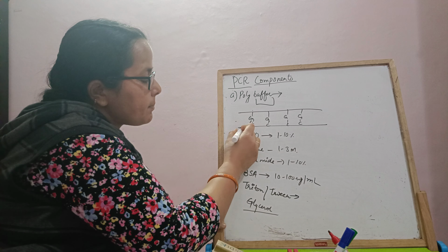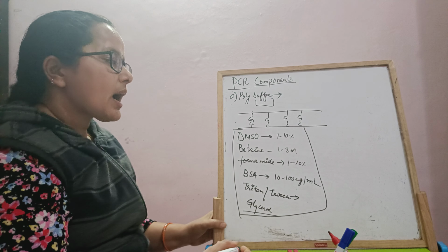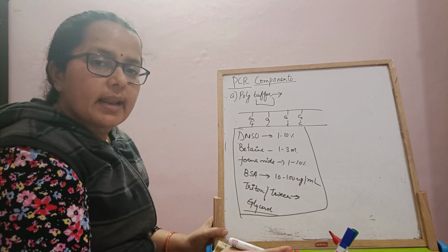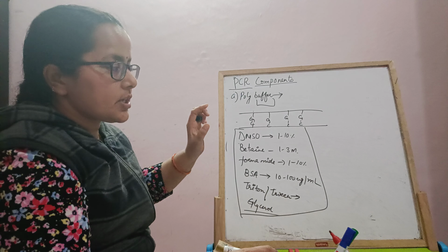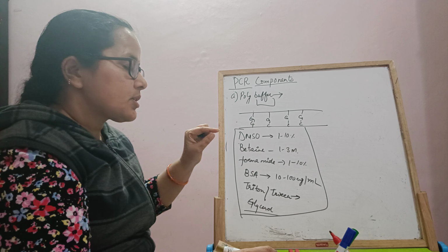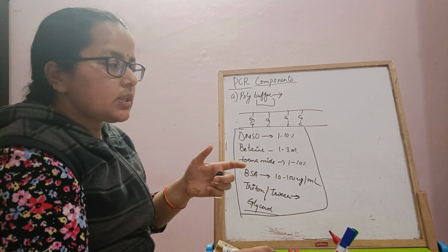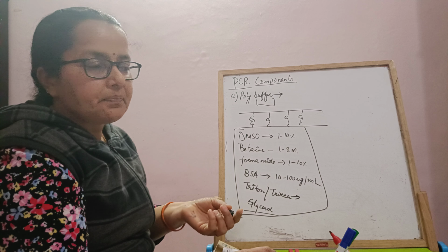Whenever we want to use these components, we have to standardize them according to the PCR we want to amplify in our lab. So all these components we can add to GC-rich templates. Wherever we are working with GC-rich templates, we have to select one of them to melt the template, so that a successful PCR can be obtained.